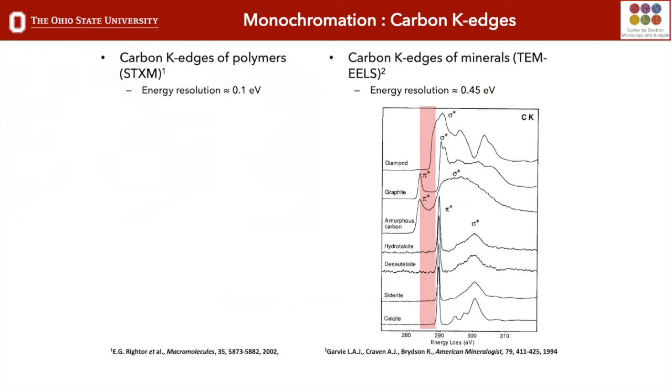And if that doesn't mean anything to you, I want to show you these spectra so that maybe that can resonate a little better. If we look at carbon and you think about diamond and graphite, and obviously people talk about graphene now, but we can think about highly ordered pyrolytic graphite, which comes out of rocket nozzles and volcanic ash. Carbon orders differently, right? You can see here that there's very known different carbon ordering. If you have diamond or graphite or amorphous carbon, the pi star and the sigma star bonding is different. We can resonate those bonds in EELS and resolve changes in the pi star and the sigma star bonding.